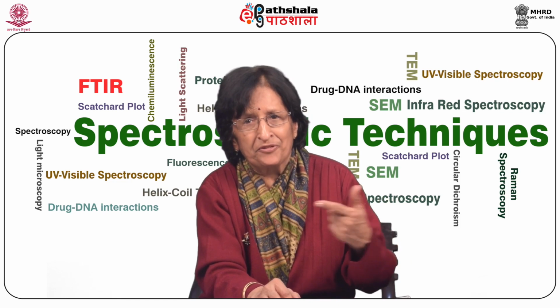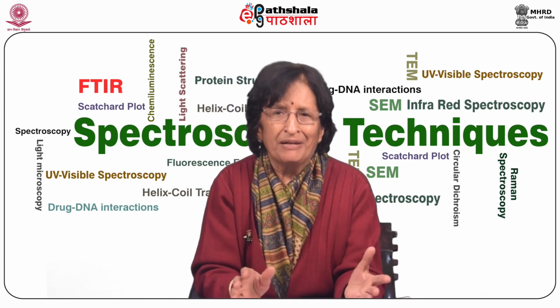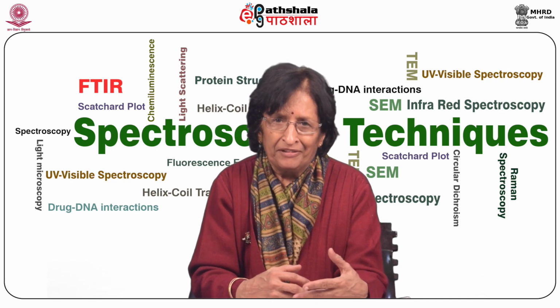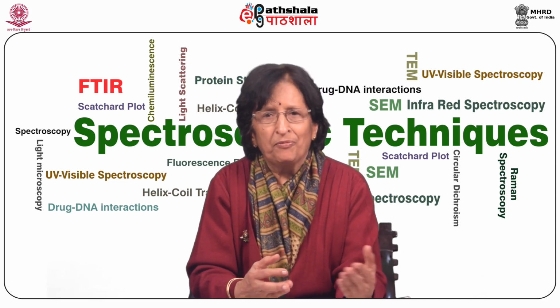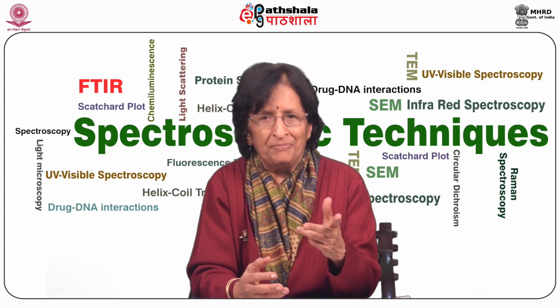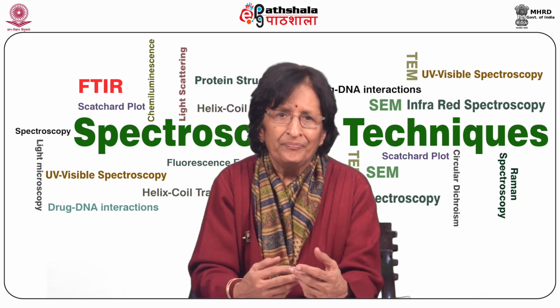In a double beam instrument, light is split into two before it passes through the sample. There can be two detectors for sample and reference, or a beam blocker which blocks one beam at a time, and the detector alternates between the two beams. So you save some money on the multiple detectors.